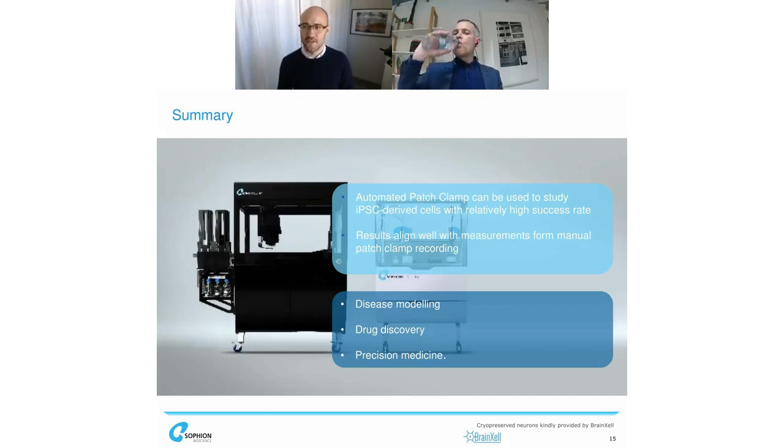Yeah, it's a great question. We can only judge from the electrophysiological signature that we are reading out, where we can differentiate with expected patterns. I mentioned this when I talked about the voltage-gated potassium channels, that we've seen those that expressed the A type. Those were typically also the ones that then showed a transient inward current, which would resemble a more mature neuron type, where the ones with the delayed rectifier type may be more of another cell type.